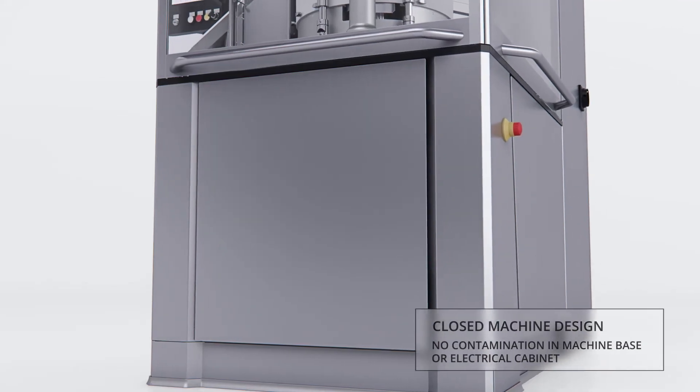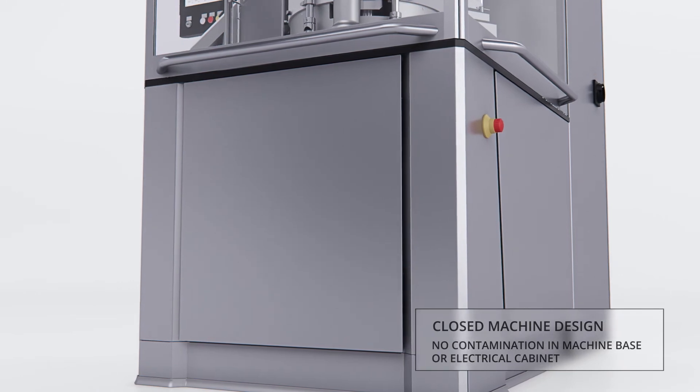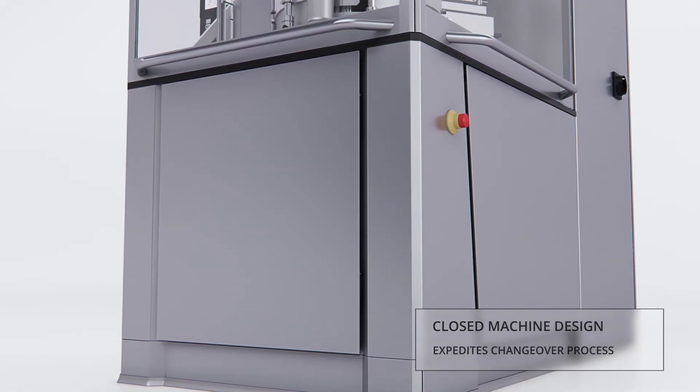The result is a fully sealed machine with no heat transfer to the compression zone of the press or to the compression room.